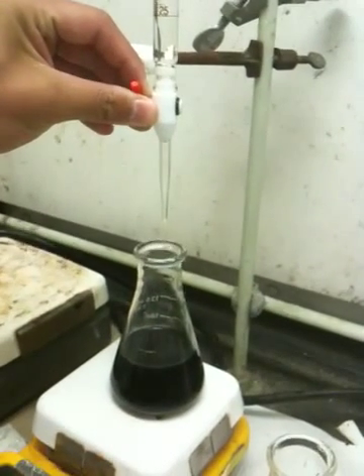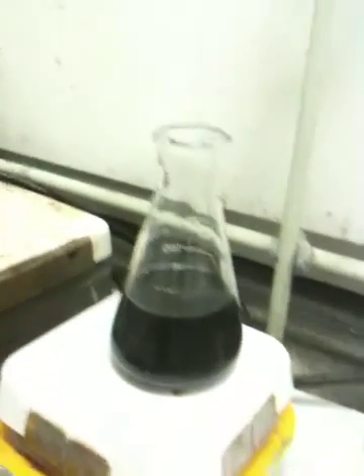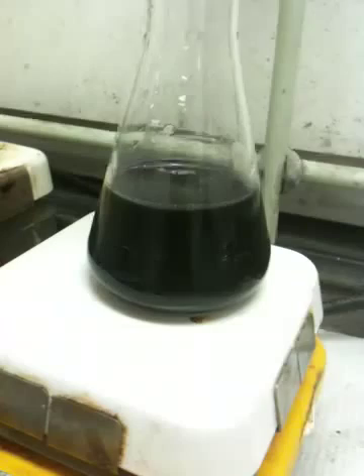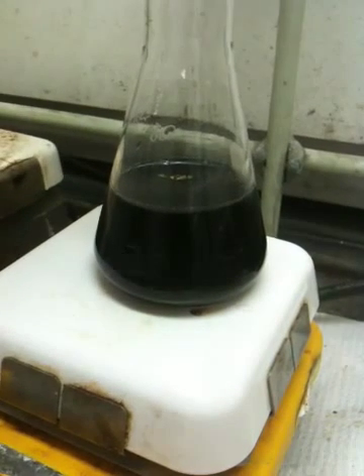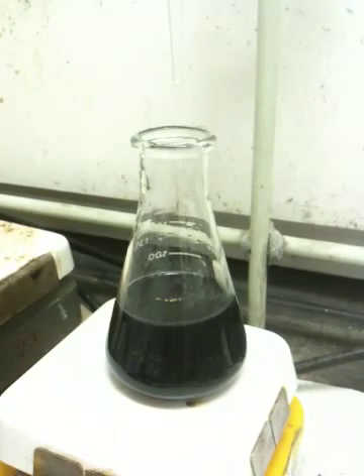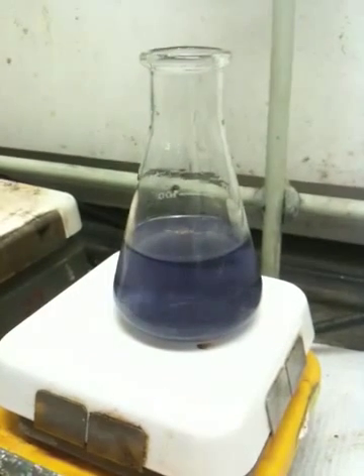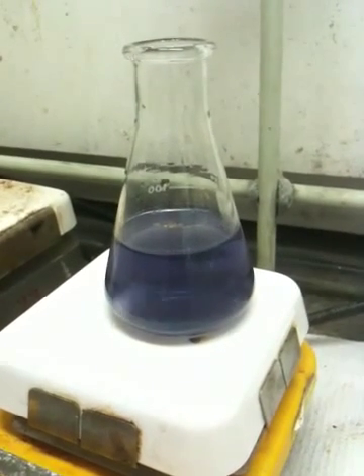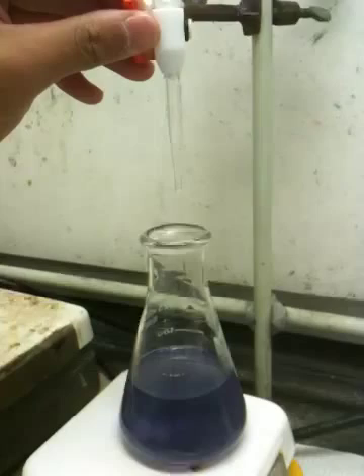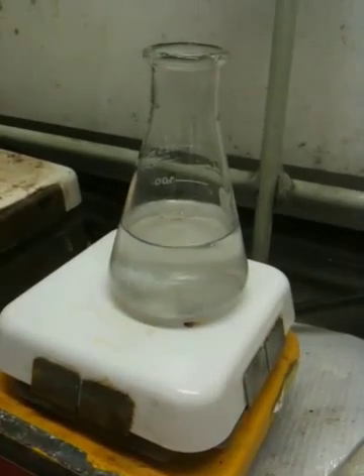Titrating. It usually takes one to three drops, and you'll see the magic — it's going to actually magically change to a super cool color called clear. It resisted the change. We have a resistance change here. There you go, drop it — there it is. Finish it off, please.